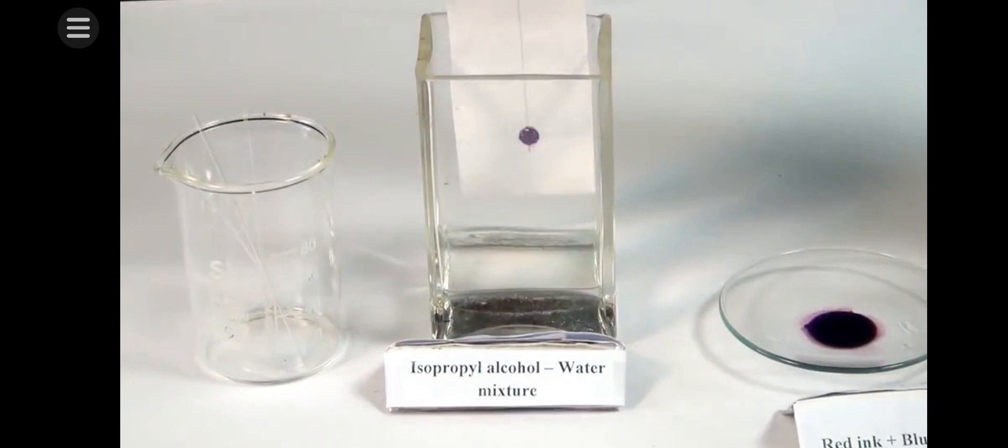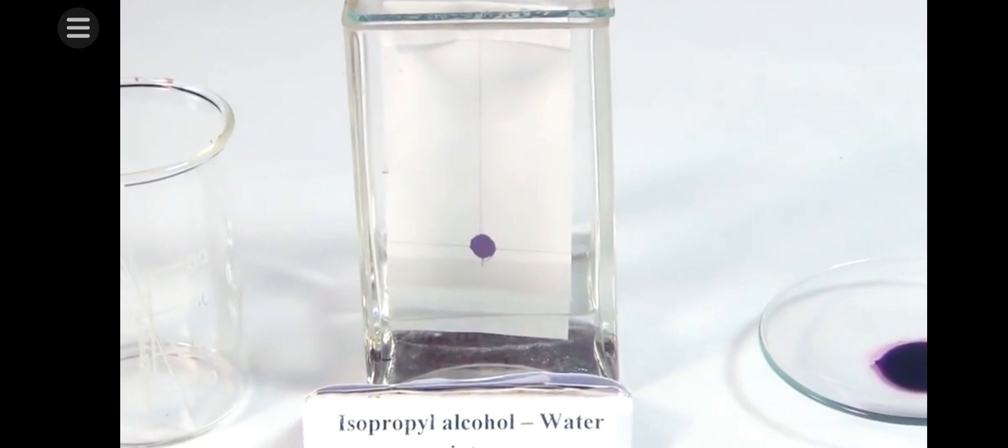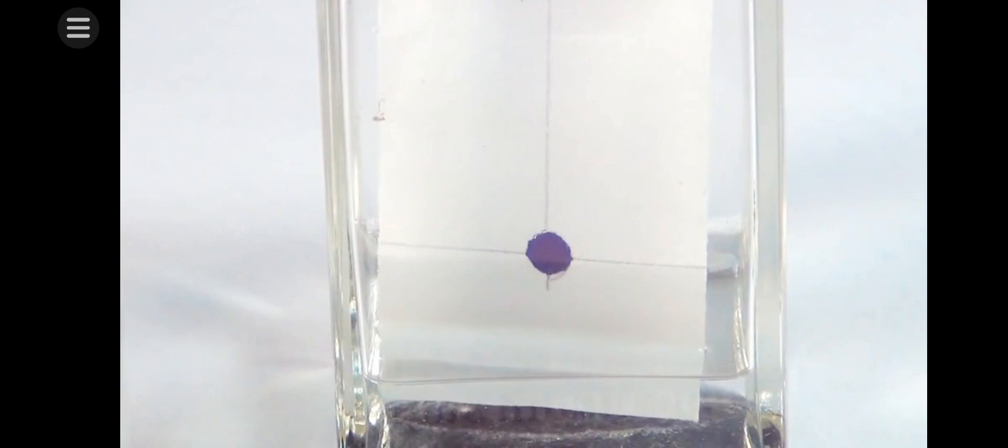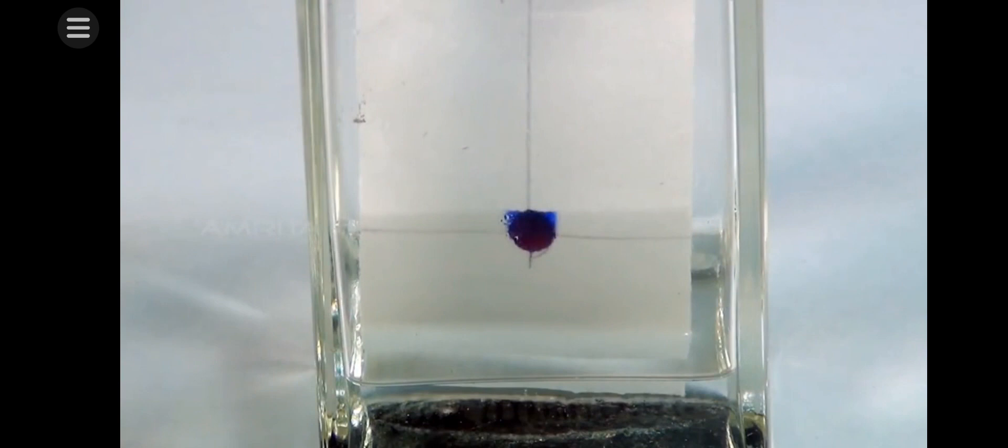Take a piece of thread and tie the filter paper to it. Suspend the filter paper vertically in the chromatographic chamber containing solvent which is a mixture of isopropyl alcohol and distilled water. Make sure that the pencil line remains about 1 cm above the solvent level.